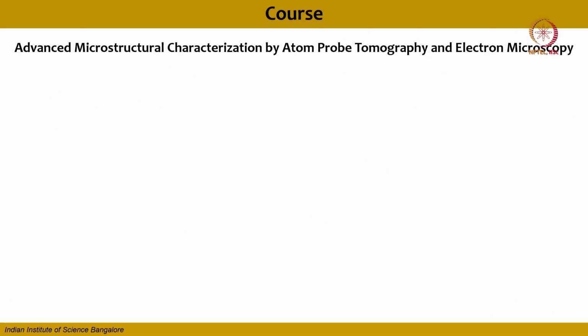Now, in the last classes we discussed atom probe tomography. We discussed sample preparation, focused ion beam, the use of the focused beam for sample preparation, and we also talked about the reconstructions and how to use the atom probe to get the chemical information.